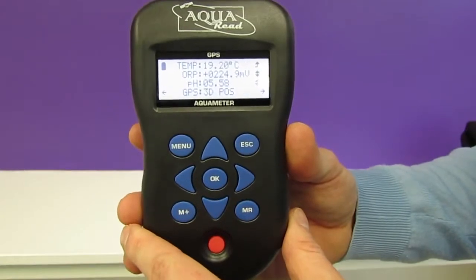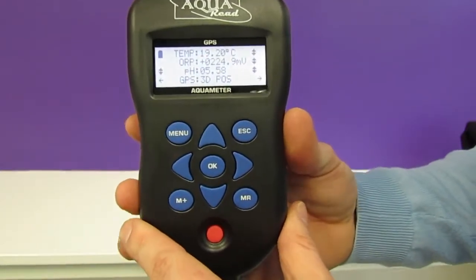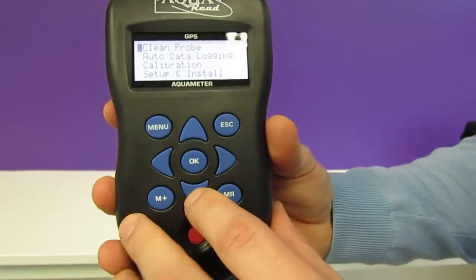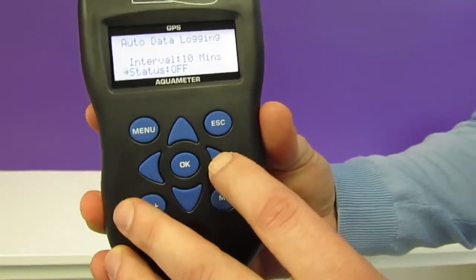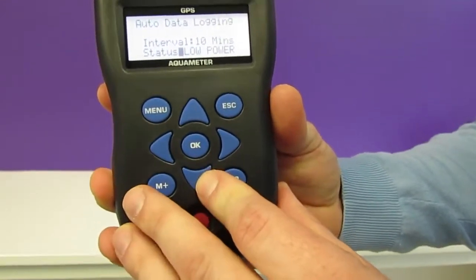One of the newest features of the GPS Aquameter is the low power auto data logging mode. To find this we go into menu, auto data logging, scroll down to status and select low power mode.